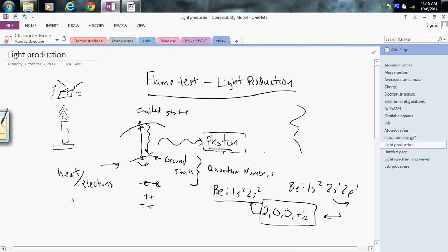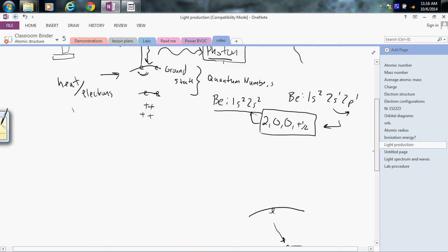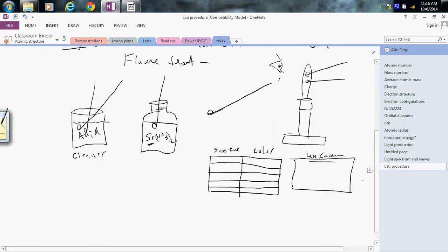And I will say, at least at this point, there's more than one unknown mixed together in my procedure. So you might have a couple unknowns. You'll see a couple different colors. So procedure-wise, make sure you have that set up, and then you can get your lab completed.